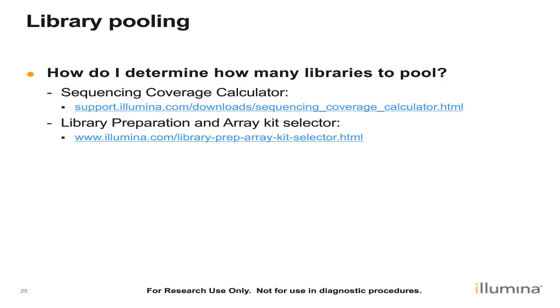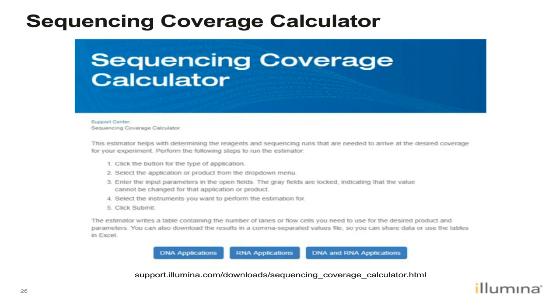We have resources here that will help us to determine the number of samples we want to pool together, the coverage calculator, and the library prep and array kit selector. This is a sequencing coverage calculator tool. Let's go through an example calculation.